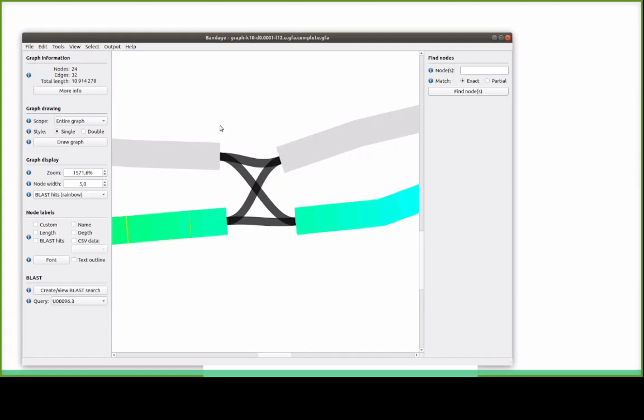So what could happen is that you have a similarity in minimizer space between the extremities of those two mutated regions, and the way it has been compacted is that instead of creating a single node, it created two nodes. So if we now map the other one, probably it should take the two on those?